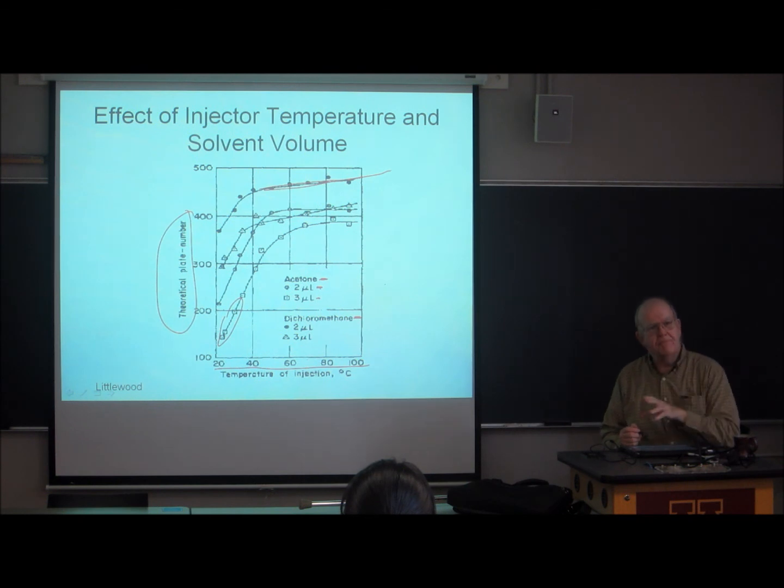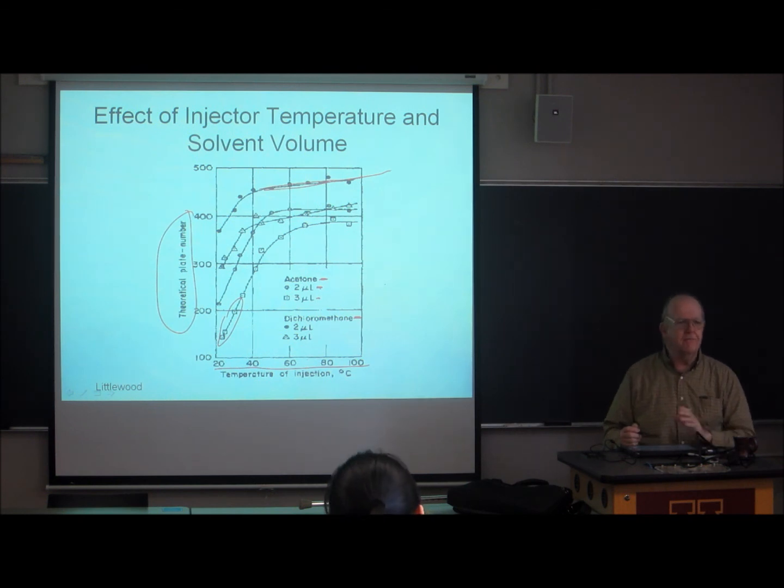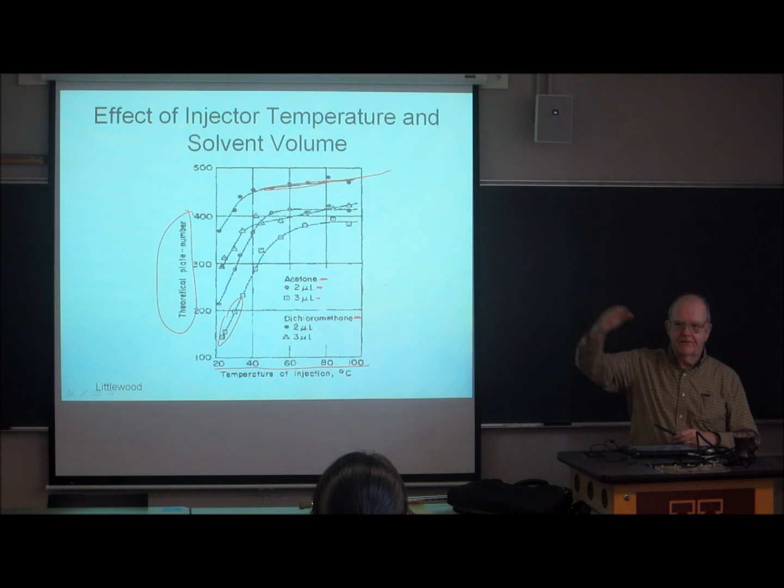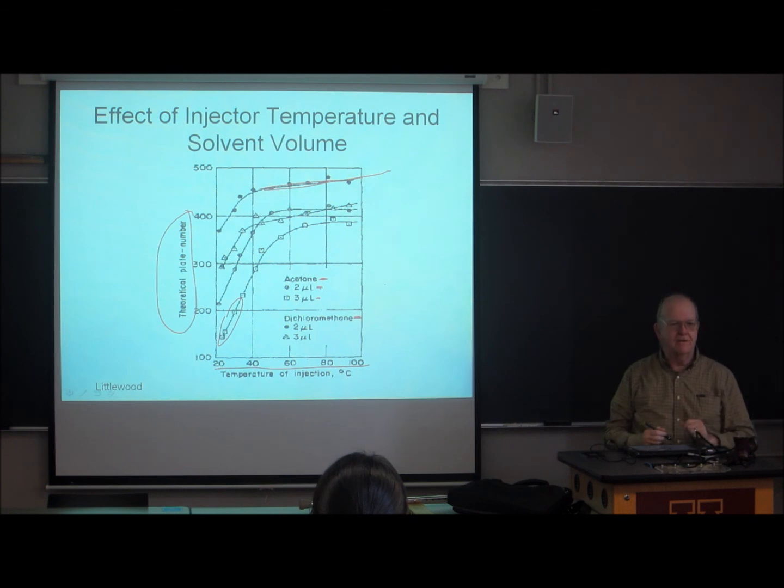In fact, the temperature really has to be not just above the boiling point of the injection solvent, it has to be above the boiling point of the sample that you're interested in. If it's not, the solvent just goes out and you leave your sample in the injector. That's a disaster.